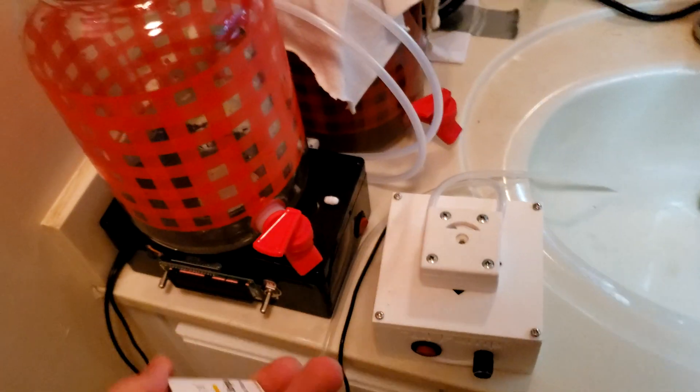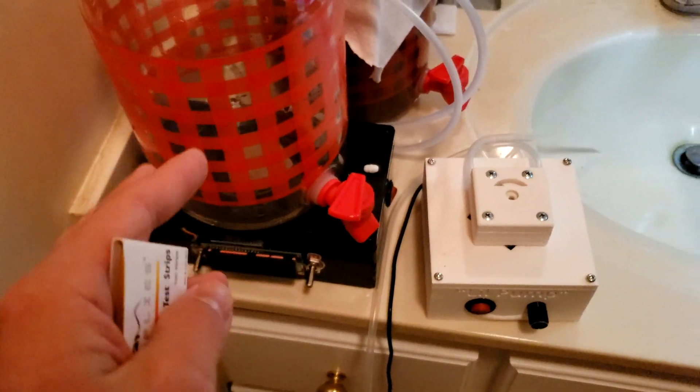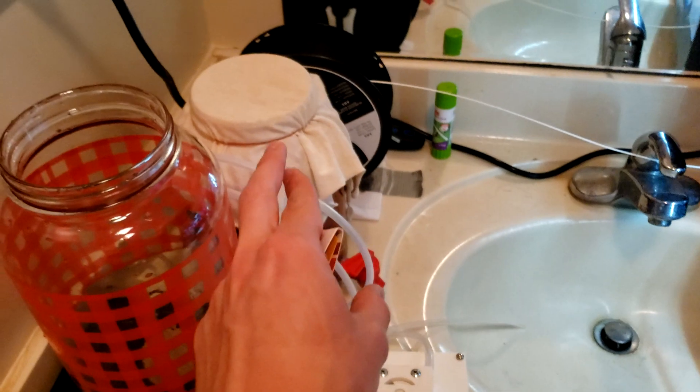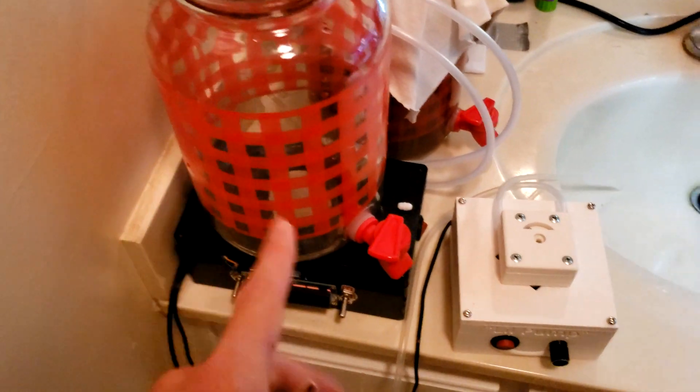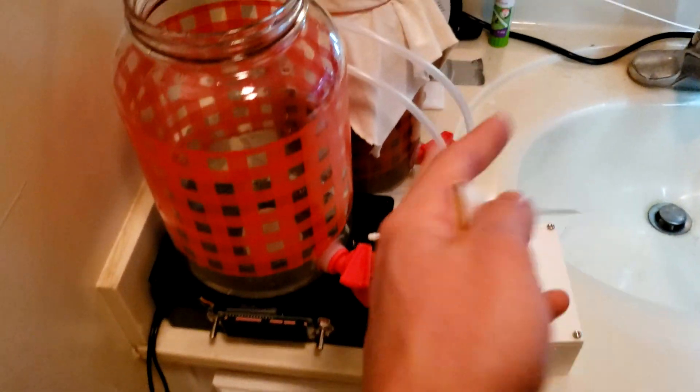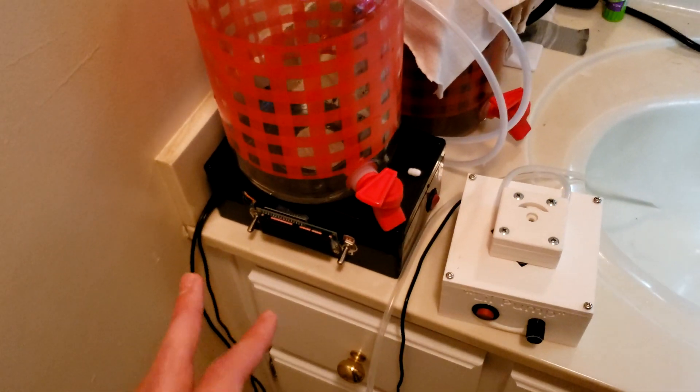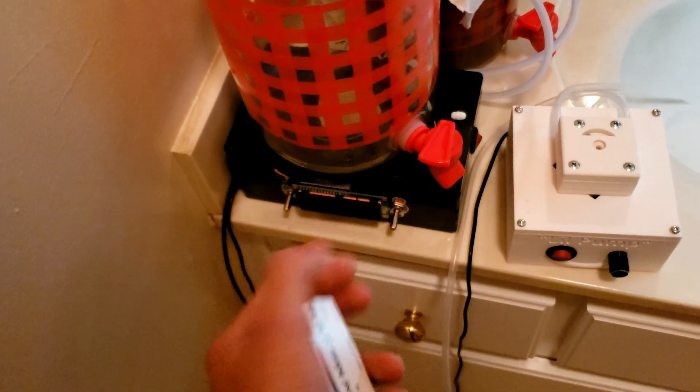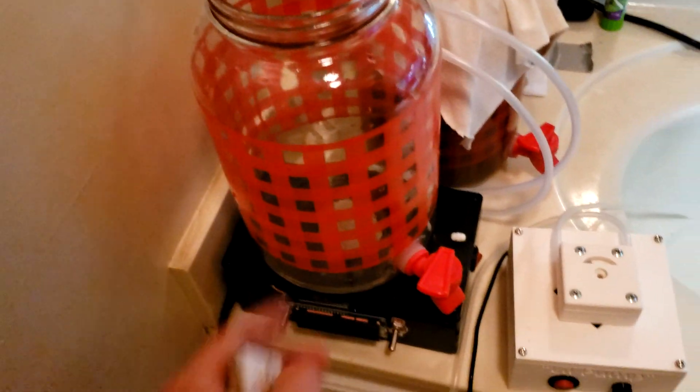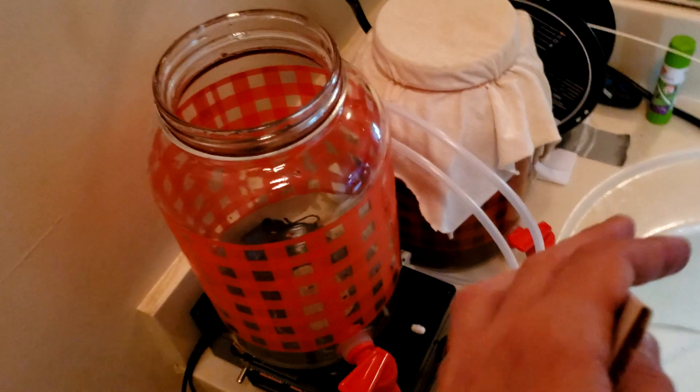So the way that I'm going to track the effectiveness of our sort of bioreactor thing is I'm going to brew some kombucha in the traditional batch way, and then I'm going to brew some kombucha in the bioreactor. So the bioreactor, it does a few things. It gives hopefully us more control of the reactor conditions than a traditional batch process, and in the control that we have, it inherently gives us a little bit more reaction speed or growth rate in this case.